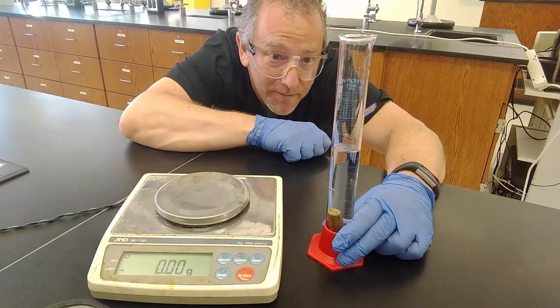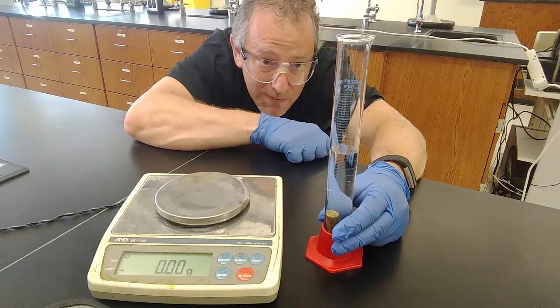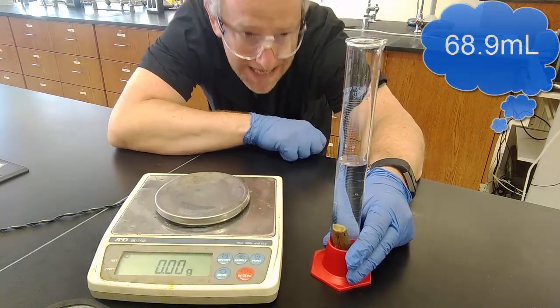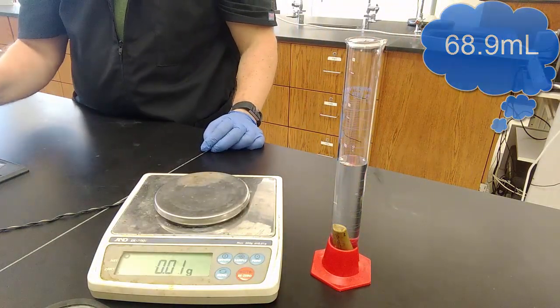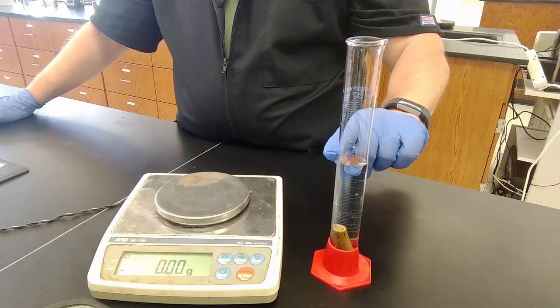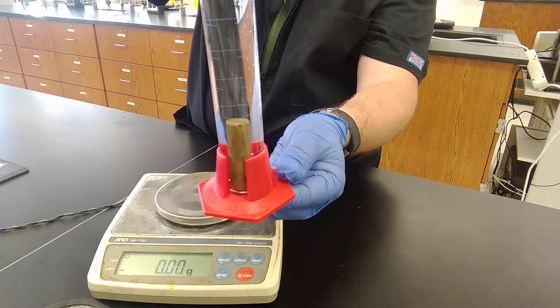So I need to get my new volume here. And again, it is 65, 66, 67, 68, 69. It's between 68 and 69, but really close to the 69 line. And so on my data sheet, I record 68.9. Okay? And then step 6 is calculate the volume of water, where we started subtracted from where we ended up. And that will give us the volume of space that our metal bar is taking up in our liquid.